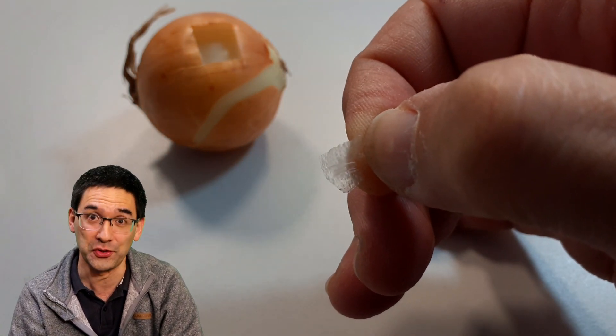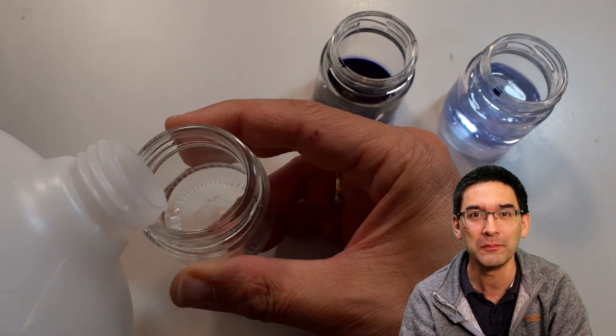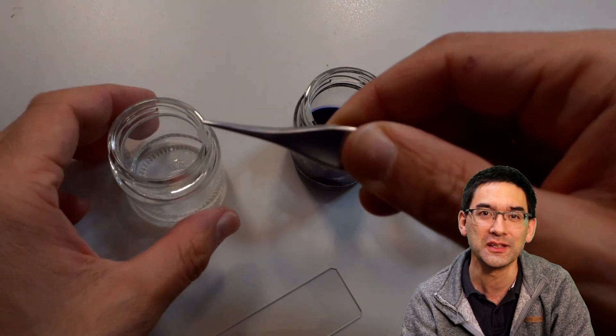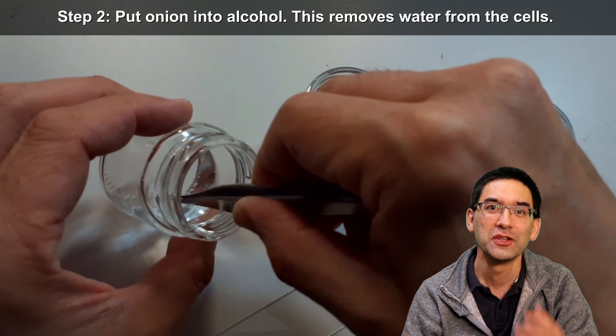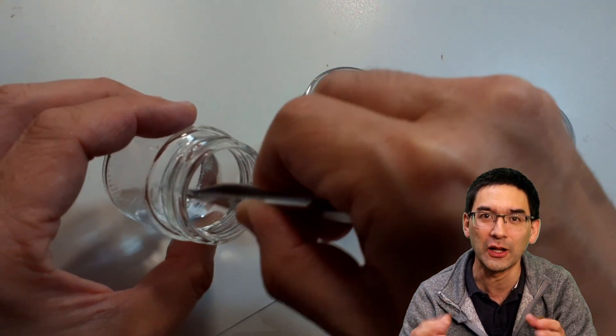You need tweezers. You also need concentrated alcohol — I'm now pouring that in — and beside the ink, some water to rinse the onion cells from the ink. First, you dip the onion into the alcohol for just a few seconds.